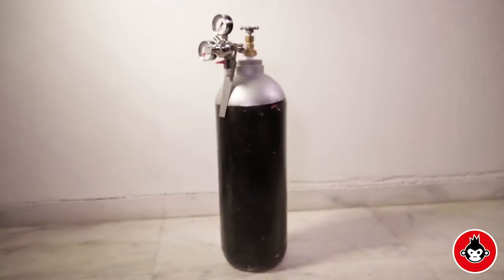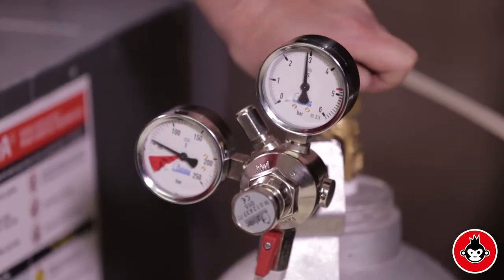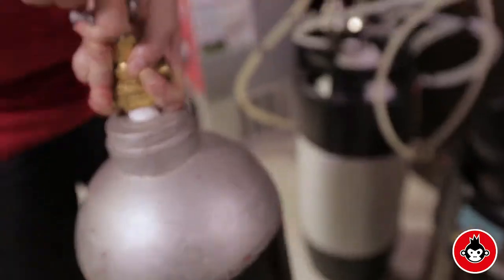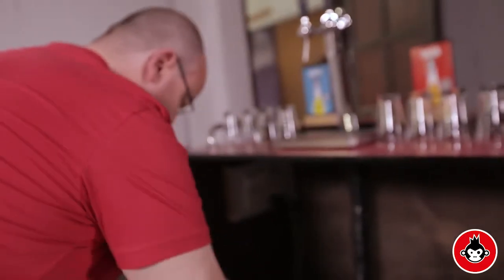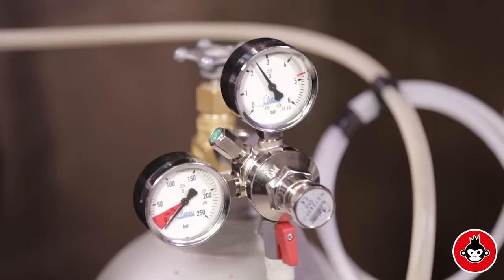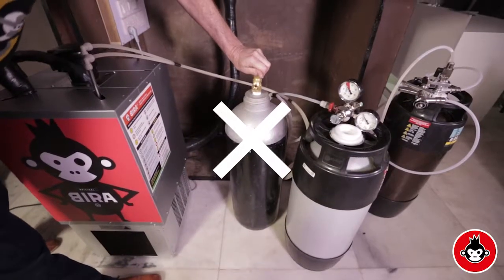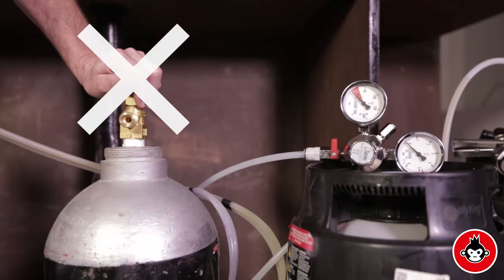The CO2 cylinder contains gas at a very high pressure and must be handled extremely carefully, as improper handling may lead to damage and injury. The CO2 cylinder should always be connected to a pressure regulator. Do not use or open the valve of the cylinder if it is not connected to a regulator.